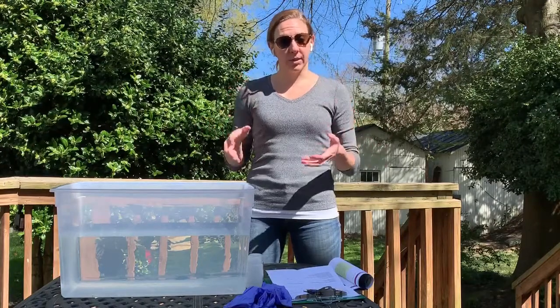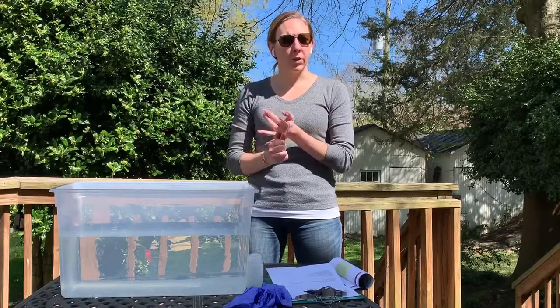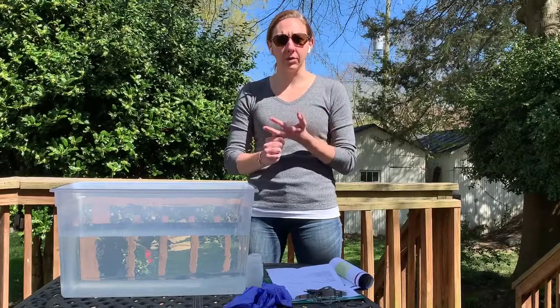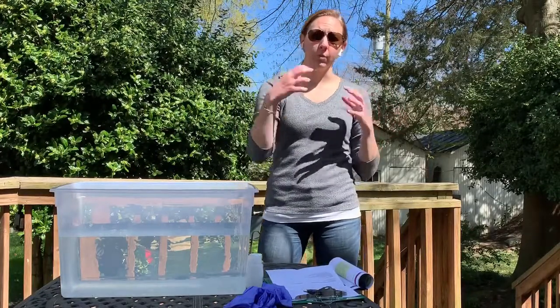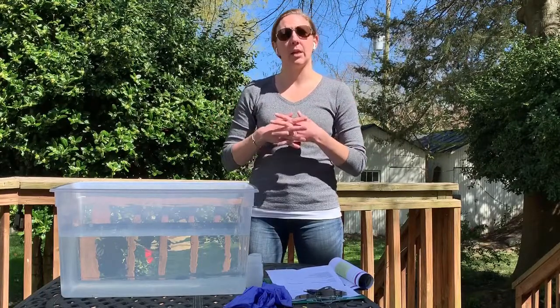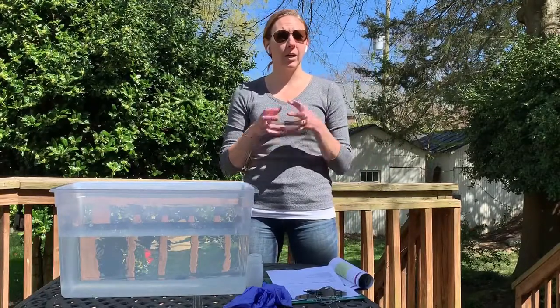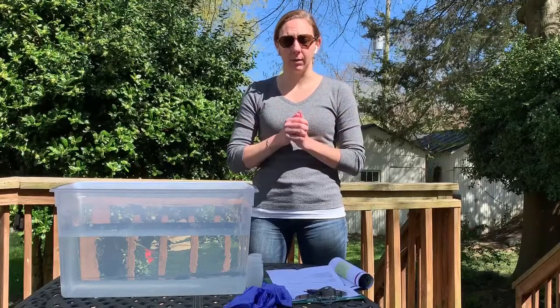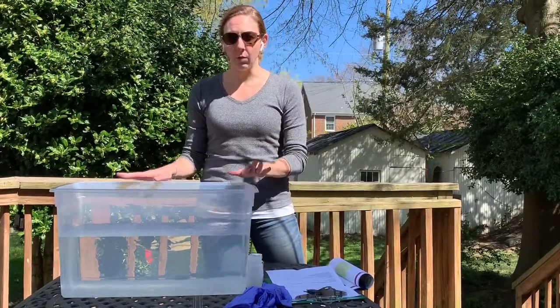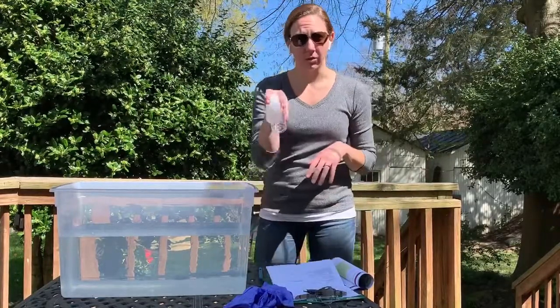Now we're going to get into the actual sampling. If you're sampling off of a dock, you want to go as far out on the dock as possible to get into the middle of the waterway. You want to avoid sampling around any boats or anything else that might contaminate your sample, and always collect the sample away from your body and hands. If you're sampling on the shoreline, sample upstream of where you are standing or wading, to reduce any sediment being kicked up and contaminating the sample. We're going to demonstrate how to collect the sample using a bucket instead of out in the field. You'll do your lab bottle samples first.